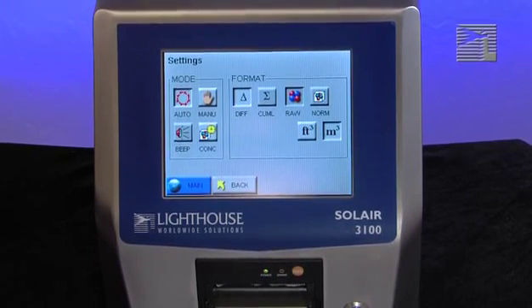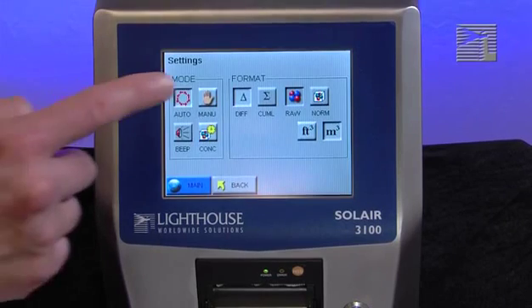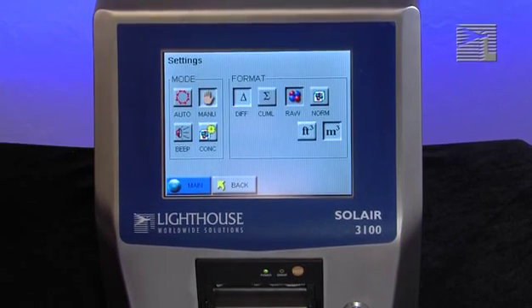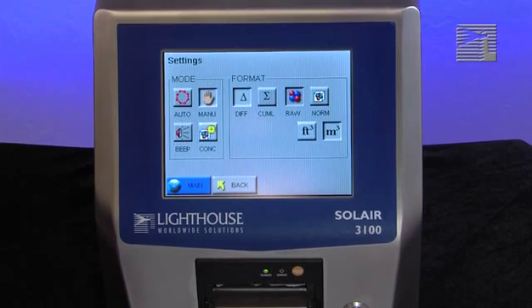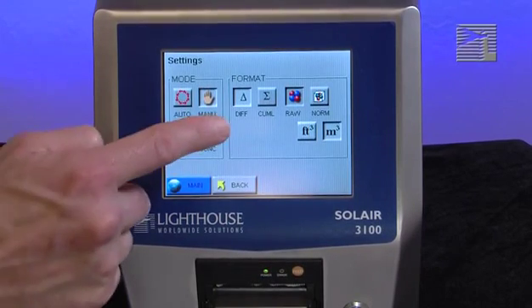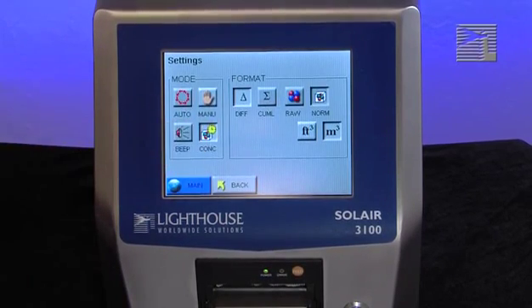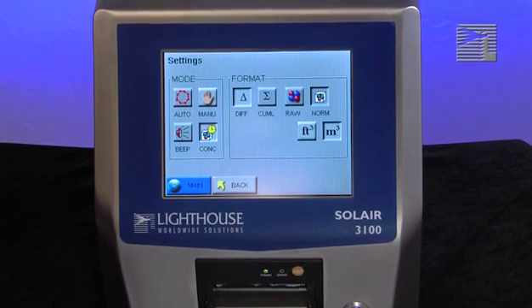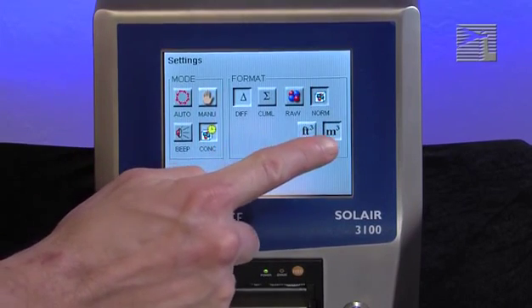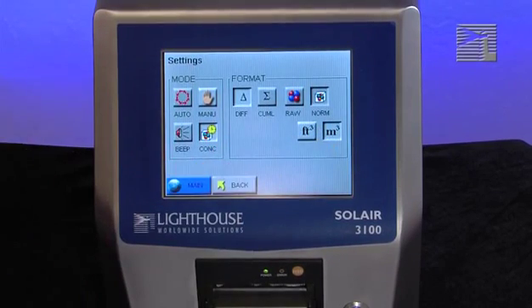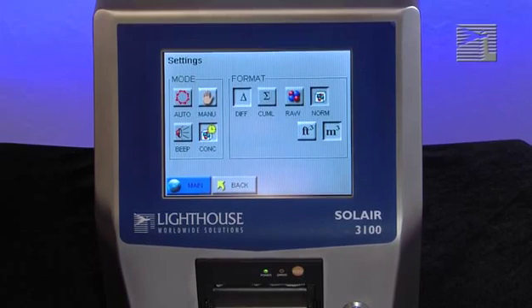When the instrument is in Manual mode, it will start counting and stop at the end of a programmed sample time. When the instrument is in Concentration mode, it gives a calculated value of the concentration of particles in a volume of air, either counts per cubic foot or per cubic meter. Sample time for Concentration mode is automatically set to six seconds.